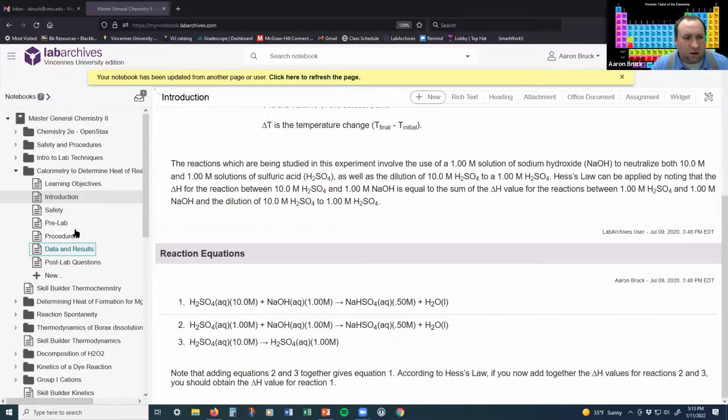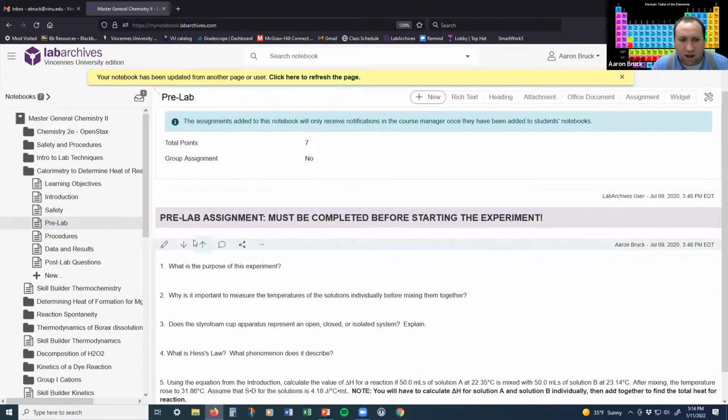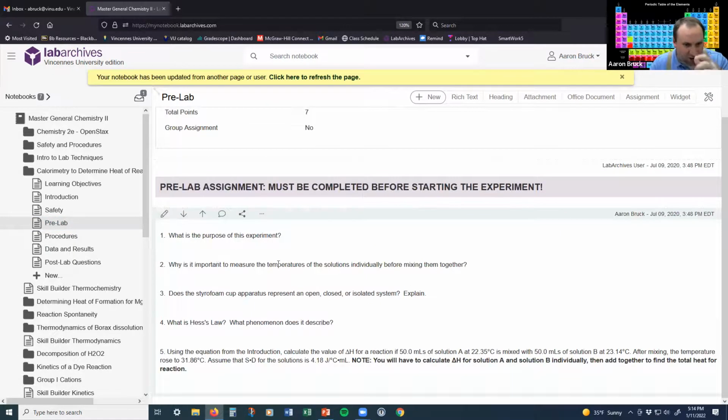So let's take a look real quick at the Prelab, and we'll kind of wrap this video up. So on the Prelab here, we've got 5 questions. First one was the purpose of the experiment. That you can get right out of the introduction. Kind of infer it based on what it is that we're doing, what we're trying to find.